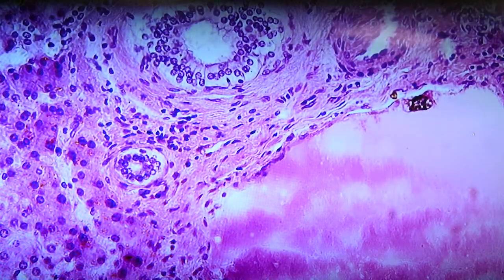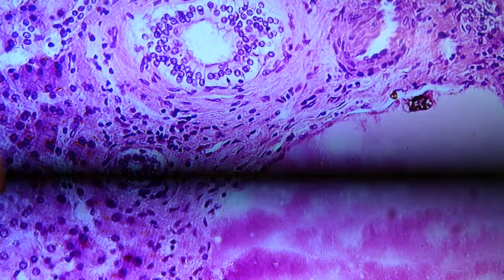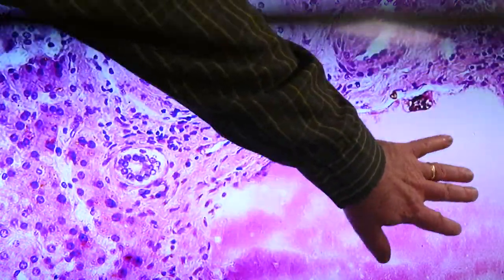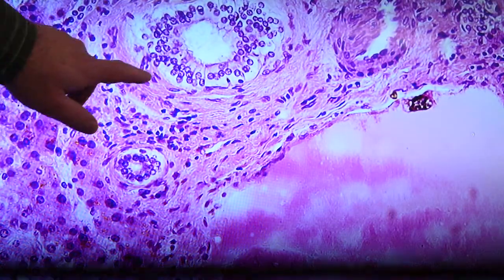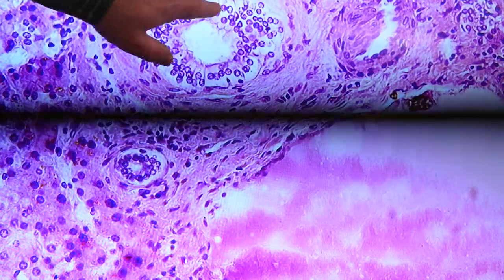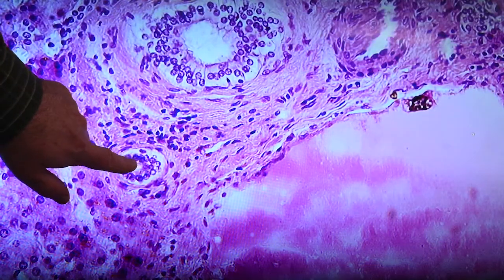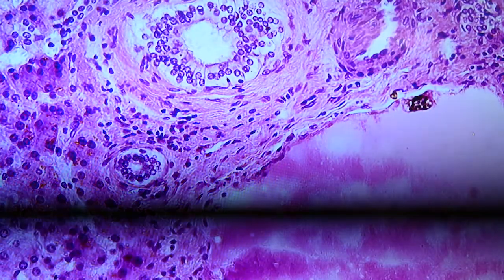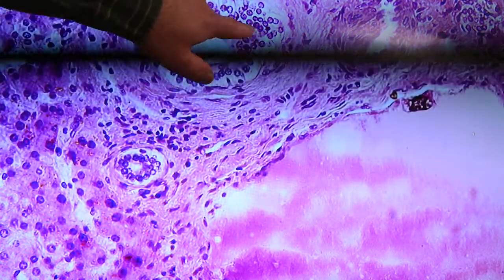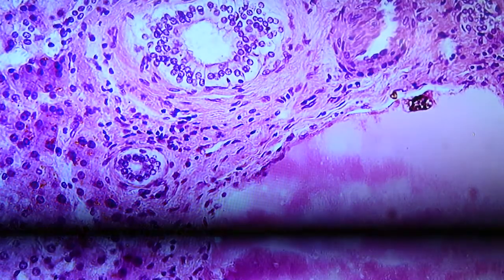One more example of a triad here. Here's your artery component. Here's the hepatic portal vein branch, very large piece of this. And then this is a fairly large duct. We've got columnar cells in this bile duct. And there's a smaller duct down here with not as tall cells, I should say. A cuboidal epithelium here, a columnar epithelium here, the artery branch, and the hepatic portal vein branch.